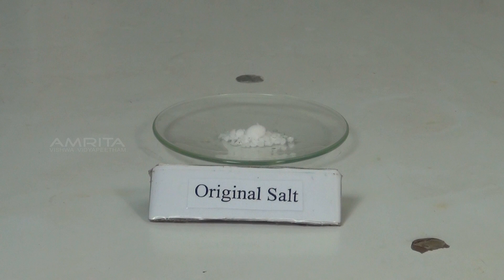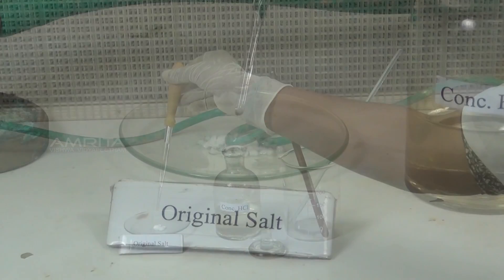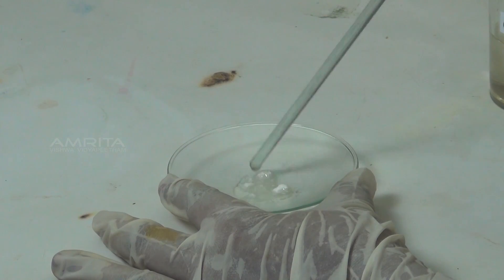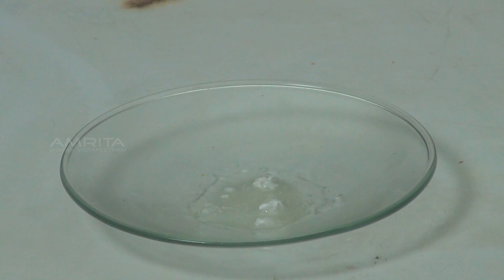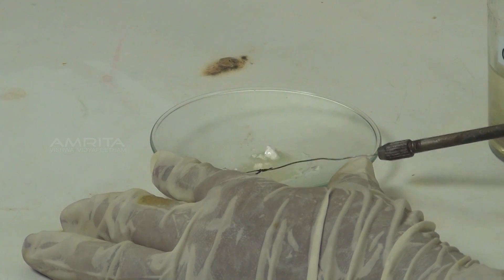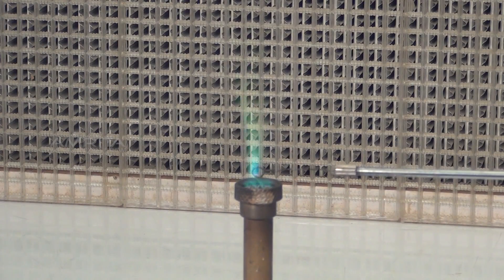Procedure: Take a small quantity of the salt in a watch glass. Add a few drops of concentrated hydrochloric acid using a dropper. Mix the contents of the watch glass using a glass rod to make a paste. Take a small amount of the paste on the platinum wire loop and introduce it into the oxidising flame of the Bunsen burner. Green flashes indicate the presence of zinc ion.